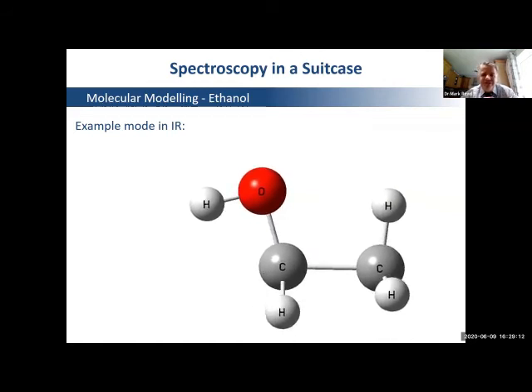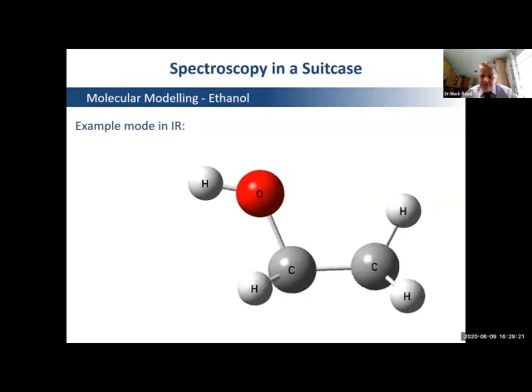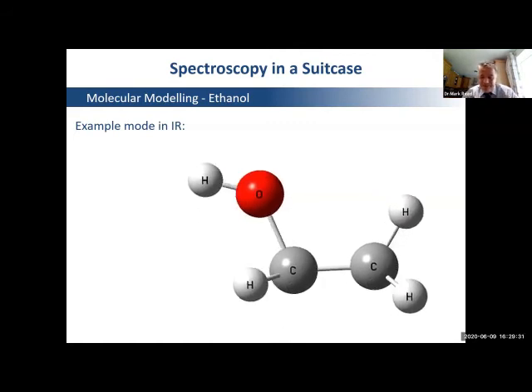Now, I mentioned it's a very versatile technique in forensics. We've looked at liquids, we've looked at solids. I'm now going to have a look at how the spectrometer can be used to run a solid unknown compound. Then we're going to use the database mode to rapidly identify the compound. And you see how quickly that can be done. And that's quite a common forensic technique.